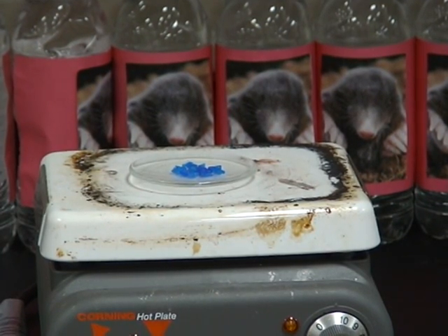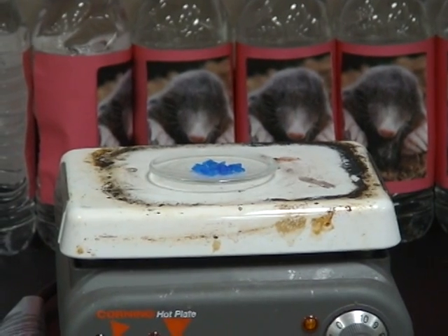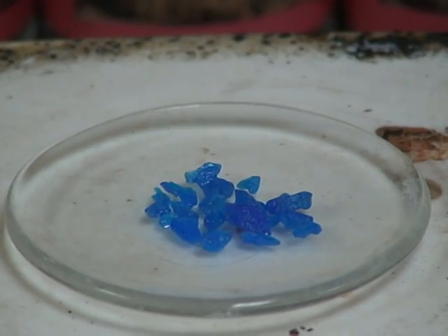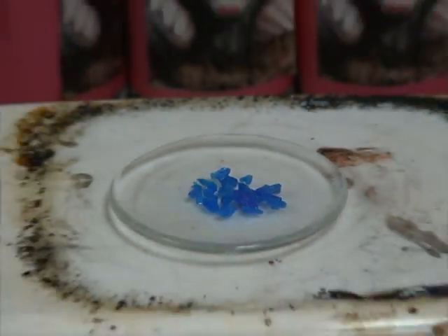And again, we're going to determine whether that is a physical or chemical change. So let me move up. You can see the crystals are blue. And we will come back to this in a little while.